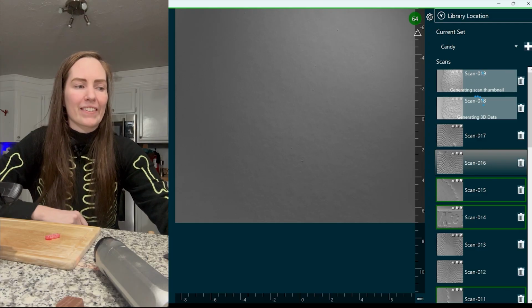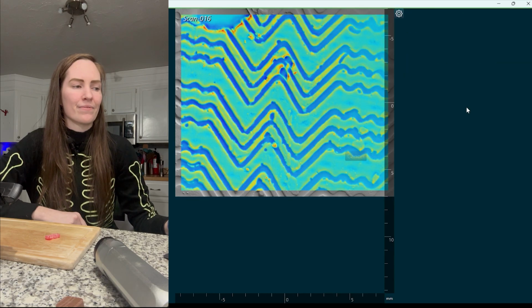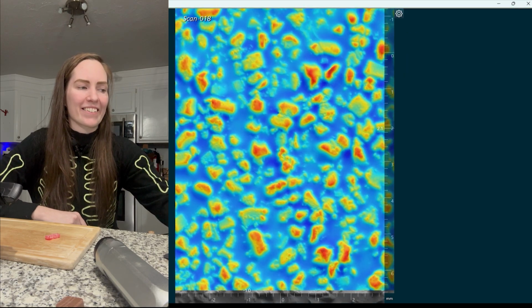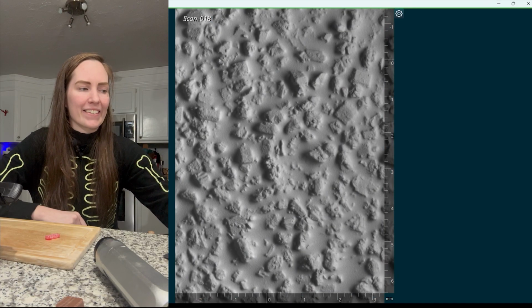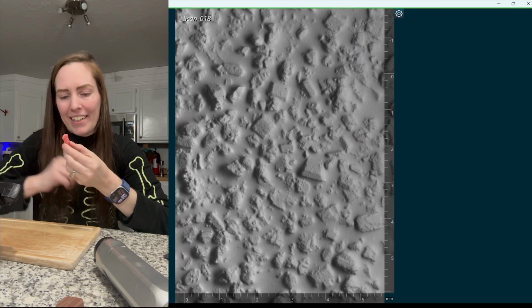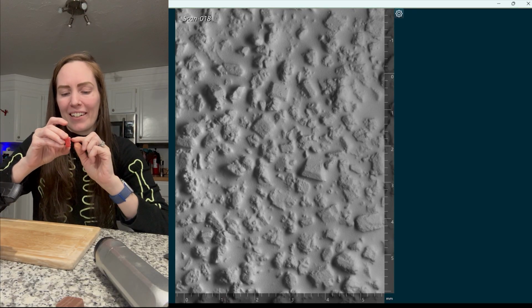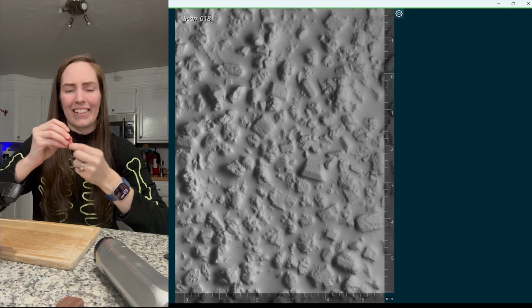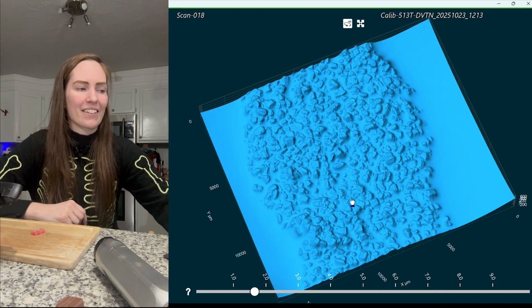We'll open this first scan up here while the other one finishes loading. And let's zoom in on this a little bit. You can really see that crystal structure. Here we're still in the edges overlay. I'll drop out of that. And you can see really the texture of the crystals, which is an interesting application, especially for GelSight with looking at any material. We can see we've got some transparent crystals and then the red gel. I guess it's also a gel. And we can take a look at that in 3D. There we go.